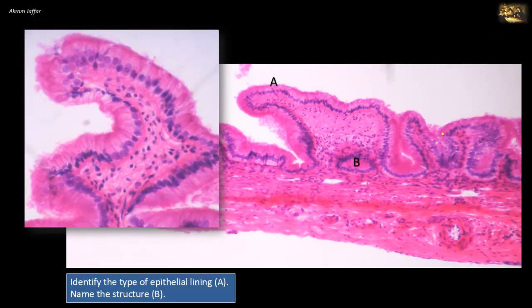Identify the type of epithelial lining, A. Name the structure, B. In the wall of this structure, we can notice three layers: mucosa, muscularis, and adventitia. So it doesn't look like it has the classical features of the gut tube — it lacks a muscularis mucosa and submucosa. In addition, the smooth muscle fibers in the muscularis layer are arranged in multiple directions: longitudinal, transverse, and oblique.